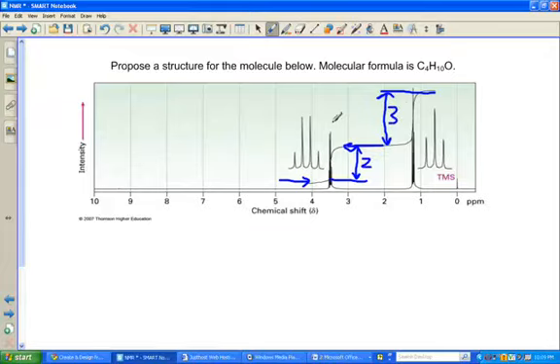Therefore, what this means is there's 2 hydrogens here and 3 hydrogens here, or at least 3 hydrogens compared to 2. This could be 6 and 4, or 9 and 6, or something like that. So these exist in a ratio of 3 to 2, and note that we have 10 hydrogens here. We have 10 hydrogens and only 2 signals, so that tells us we have a lot of symmetry. And if we have 3 hydrogens here and 2 here, 5 total, that probably means we have 2 sets of 5 to give this 10. Remember we said there was a lot of symmetry?